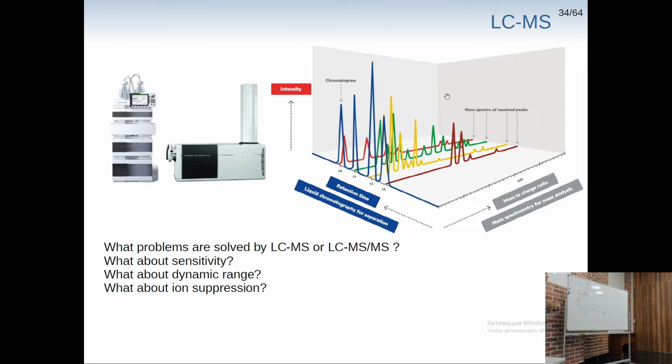So we will try to describe so-called data-dependent analysis. You get scans in just MS without fragmentation, then choose, for instance, the most abundant ion and use it for MS/MS. Of course, it will take some time, and your chromatography will move on, and then you will again get this MS and choose an ion, but you can see that the ion you've chosen in the previous series is still big enough, while some other ions are already small enough or missing, right?